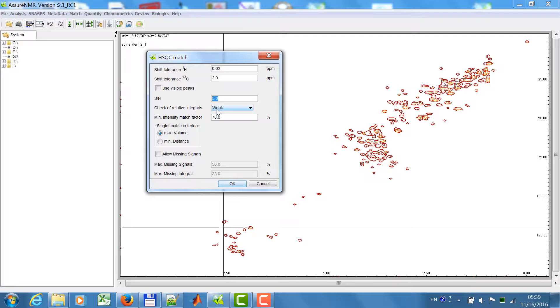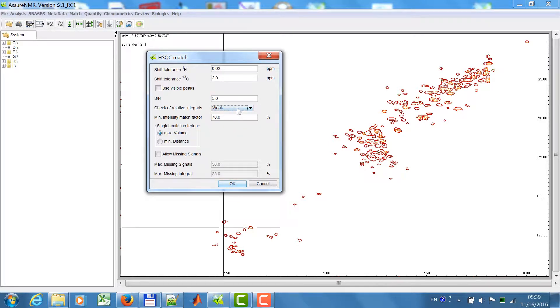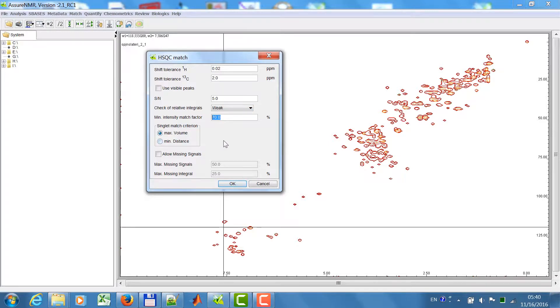I check relative integrals. The check in this case is weak, because if you have different proton-carbon coupling constants in the pulse program of the measured sample and the reference data, the intensity ratios may not be the same. So I will choose weak here. I expect a minimum similarity in intensity of 70%.